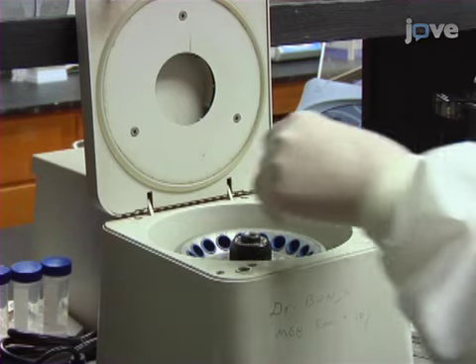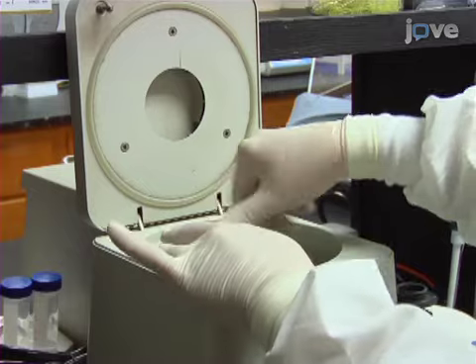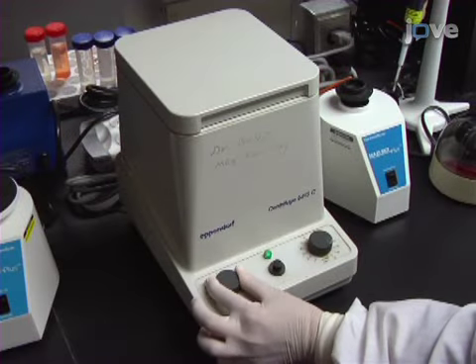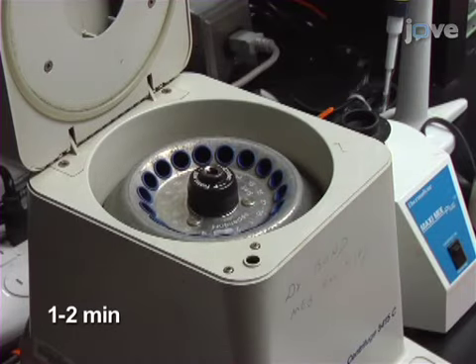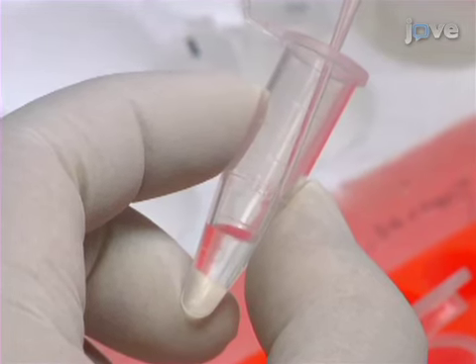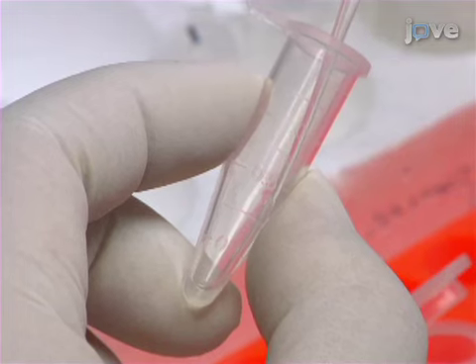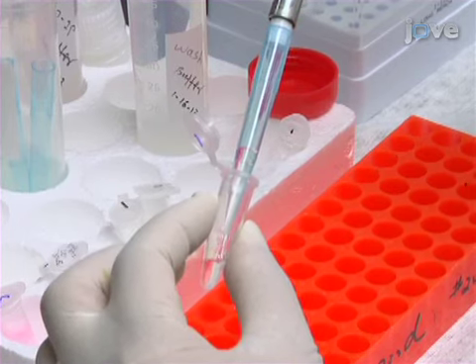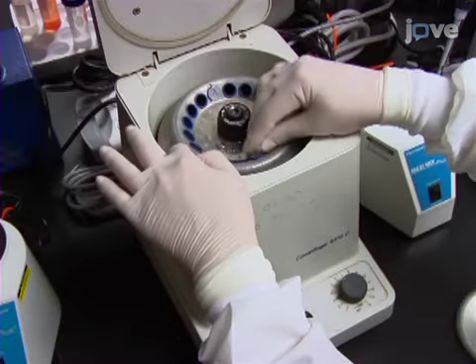The next day, pellet the resin by microcentrifugation at 5000 to 8000 times G for 30 seconds. Following the spin, wait for 1 to 2 minutes before handling the samples to allow the resin to settle in the tube. Remove the supernatant with a narrow-end pipette tip or a Hamilton syringe, taking care not to transfer any resin. Wash the resin 4 times by resuspending it in 500 microliters of wash buffer, followed by microcentrifugation.